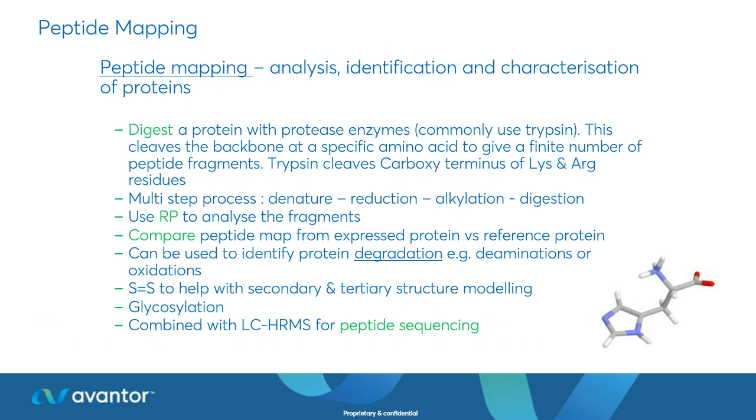So as I mentioned, one of the other techniques you can use for protein analysis is to digest your protein and analyze the map peptides. And I have simplified it very much by saying denature, reduce, alkylate, digest. That's your rate determining step. The chromatography really won't take as long as the actual preparation of your peptides. So you could potentially have a longer chromatographic step because it can take you a day and a half to prep the sample before you even get it onto the LCMS.